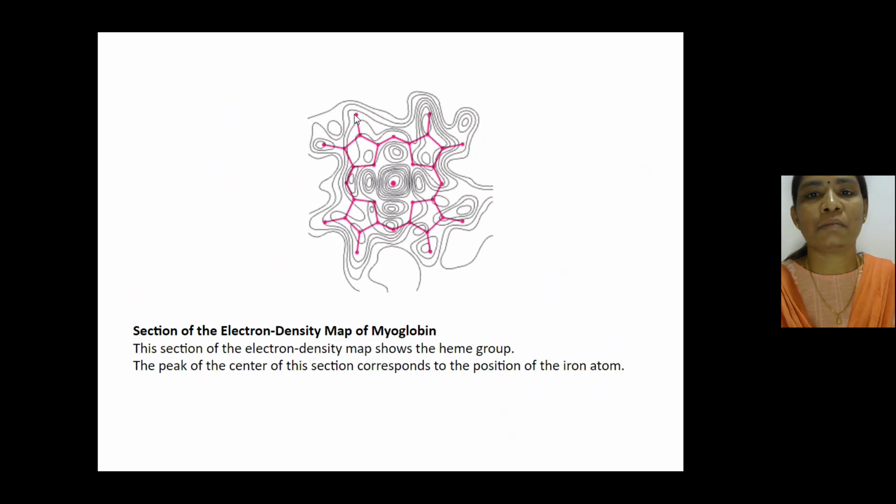For each atom you can see the contours, the curves, in the electron density map. These represent the electron density map, and when you have the data, only this you will have. This pink myoglobin, you will not have that information. You have to fix that molecule on this map in the proper position, so multiple refinements have to be done in order to do that.